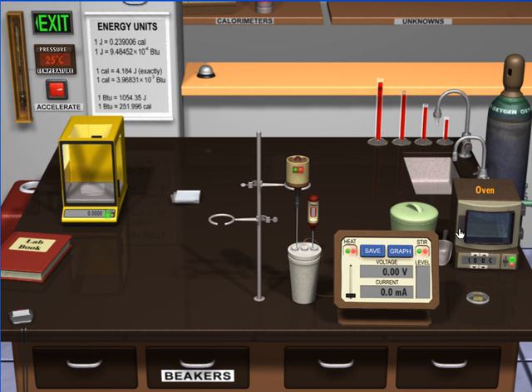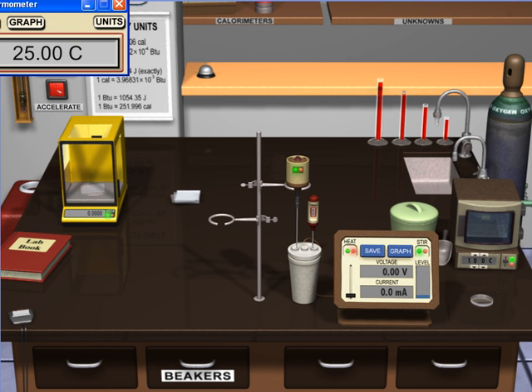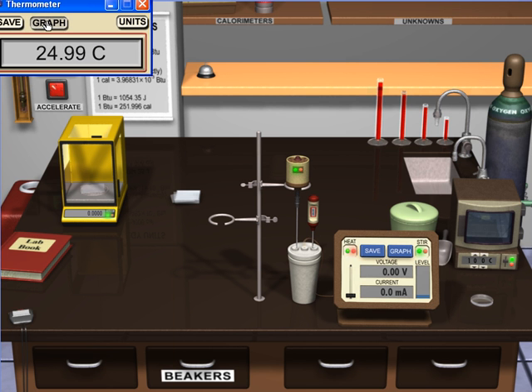Grab that out of there. Bring it over. Again, heat the gold back up. This should work a little better. Whoops, I turned that off by accident. There we go. All right, we want this stirring, but not yet. 50 milliliters of water automatically fills exactly to 50 milliliters, kind of handy. Pour it in, measure the initial temperature again.